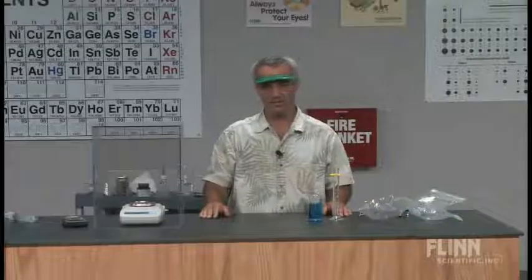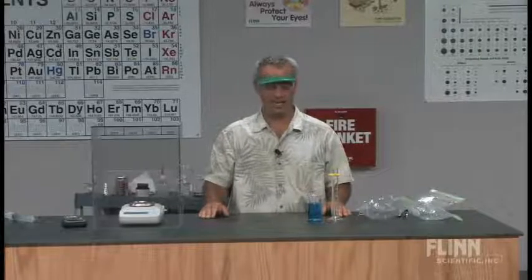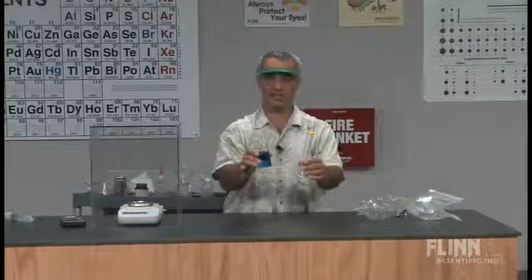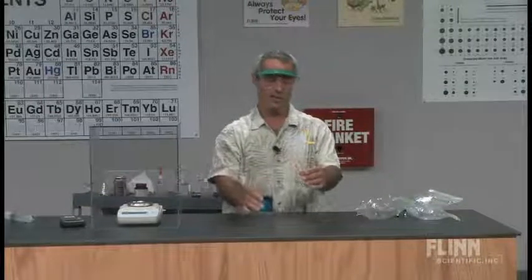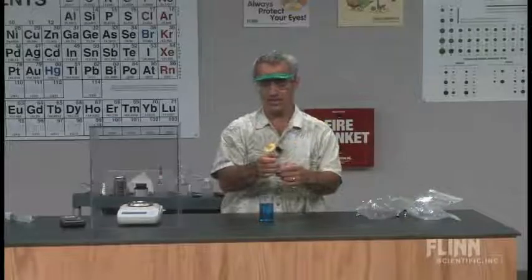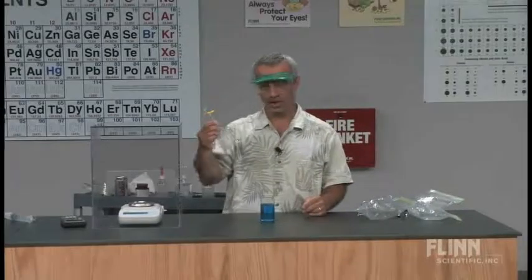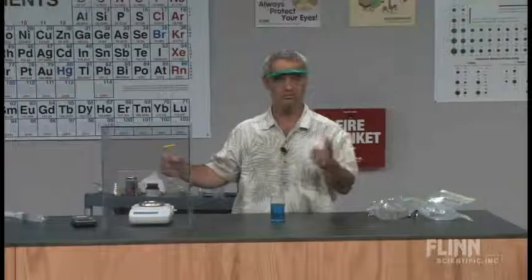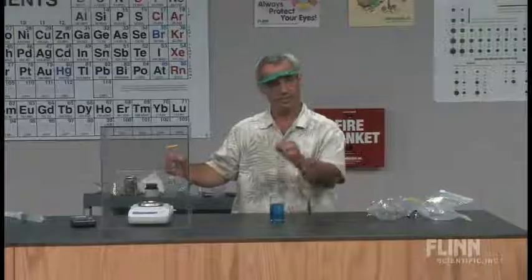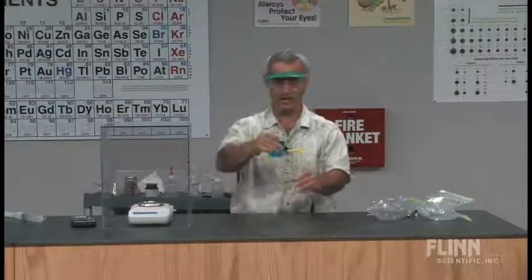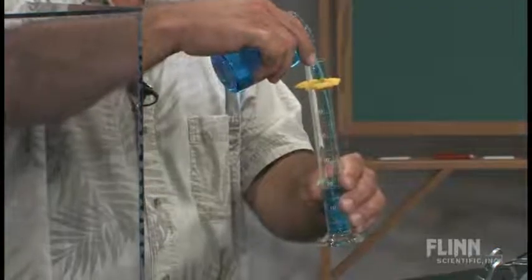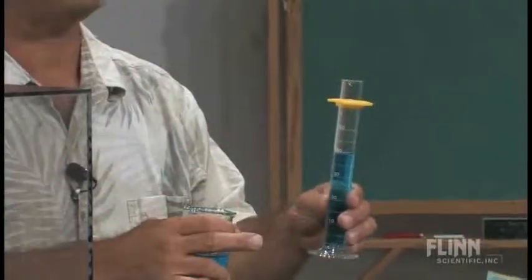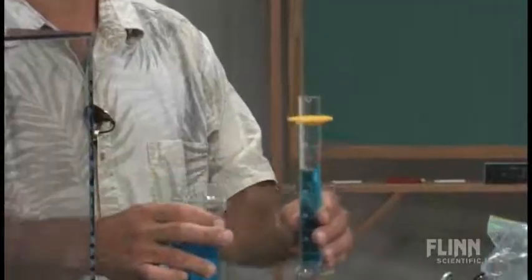Solids, we know how to do that. Find the volume, find the mass. If I gave you a liquid like this and said determine the density of this liquid, students figure out the technique. They put a graduated cylinder on the balance, figure out the weight empty or zero it, pour a certain amount of liquid in. They find the mass from the scale, the volume from the graduated cylinder, divide, and get the density. Pretty simple.